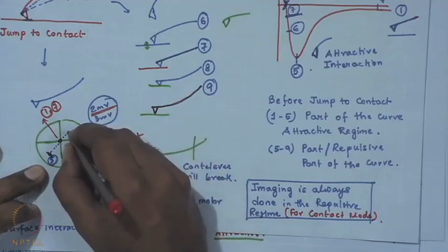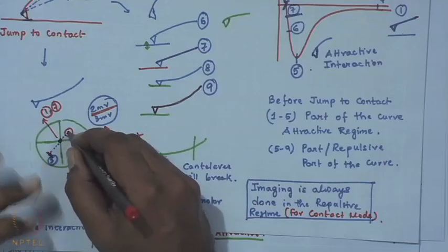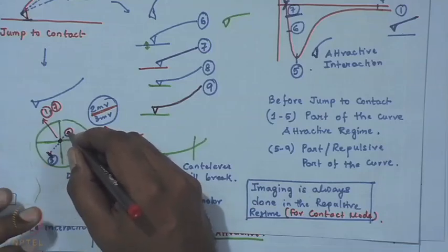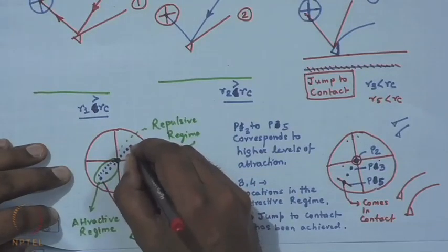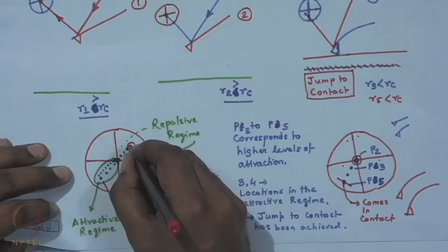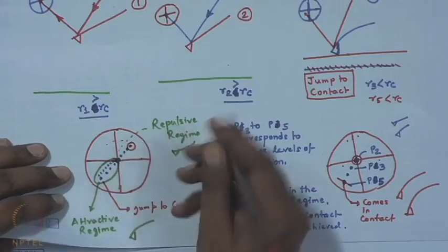Okay. So, let us say 2 millivolt is here and your deflection is shifting like this. The moment it matches this 2 millivolt set point, the approach stops. So, in other words, let us say this is your set point you have specified. So, 2 millivolt, you understand it, the moment this deflection now matches 2 millivolt, the approach stops or the stepper motor stops.